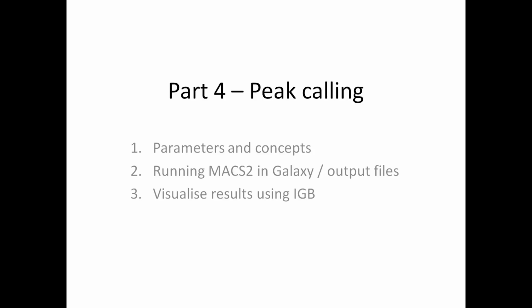One of the main reasons for making this new series is because there is now a new version of MACS, called MACS2, that was released well over a year ago. At this time, MACS2 is at version 2.1.0. If you have previously used MACS version 1, a few things have changed.